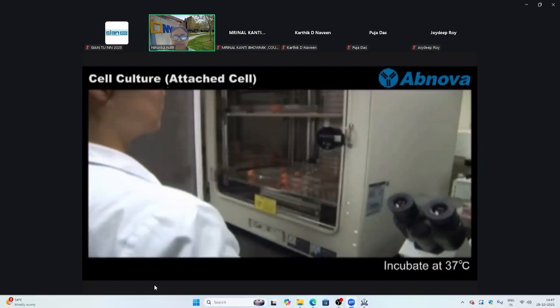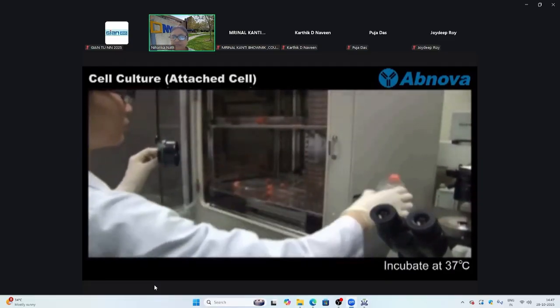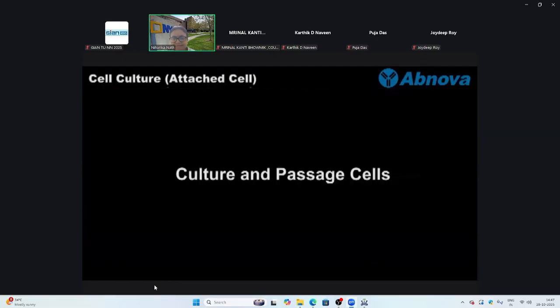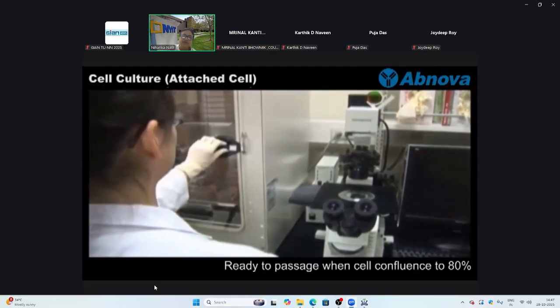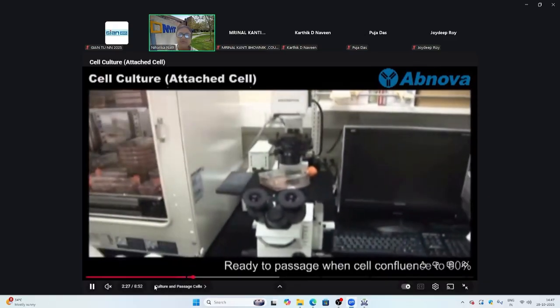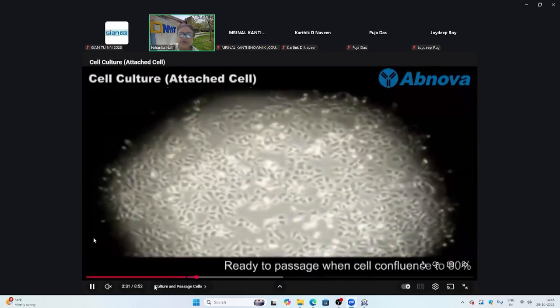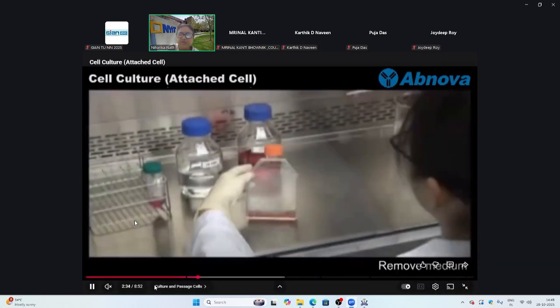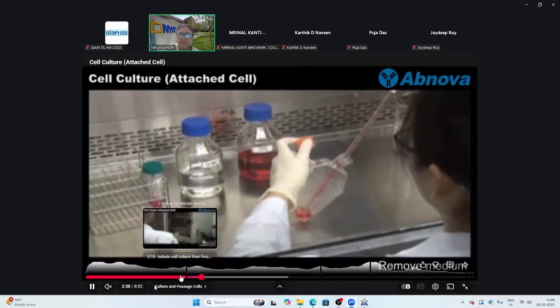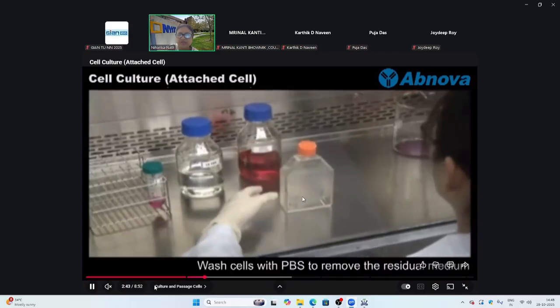They need some time. And so after just putting them in, giving them 37 degrees, those are all the cells that are being grown. Cell culture is a fairly expensive deal. And all those cells that you just saw, those round cells, are now stuck at the bottom. They are polygonal in shape. And so this is now treatment of the cells. The cells are all sticking at the bottom.